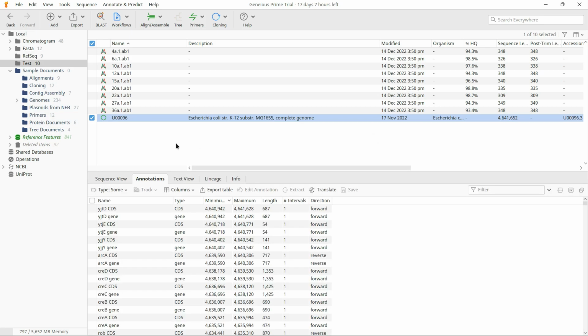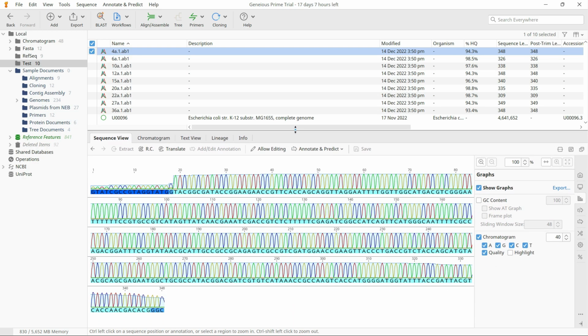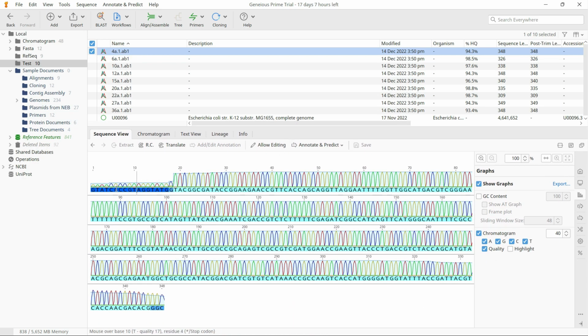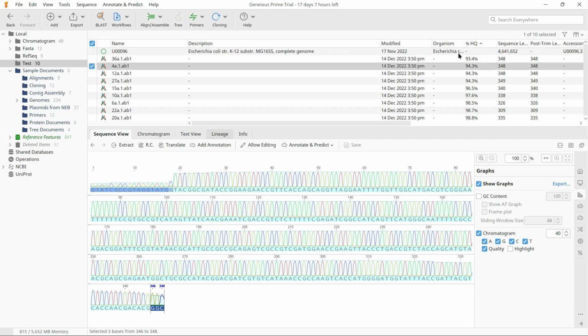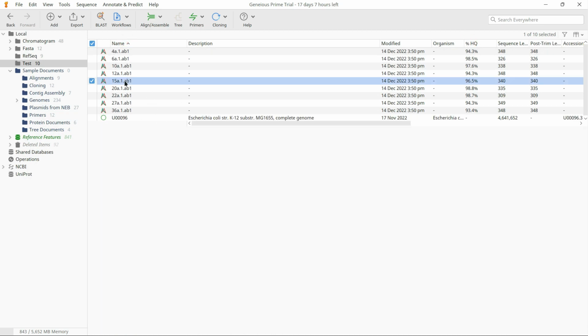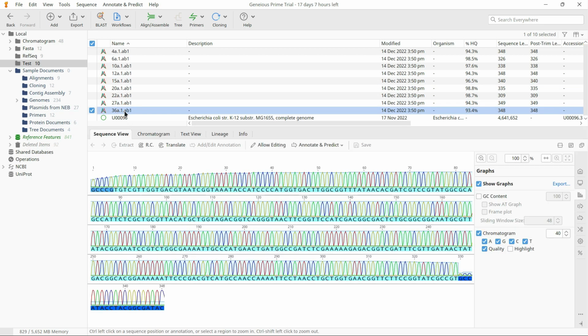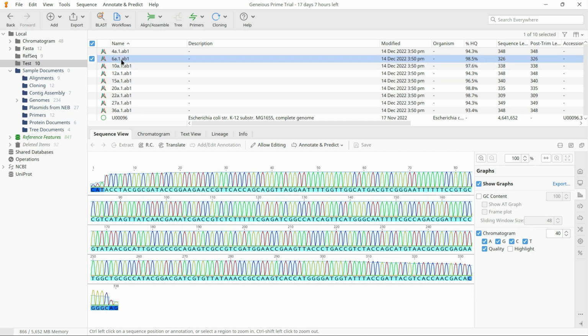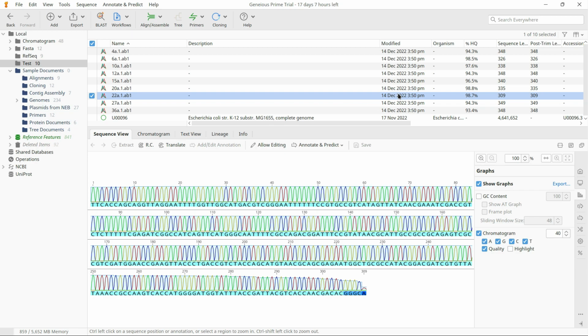The list of sequences appears immediately, where you can check parameters like the length and quality of individual sequences. The percentage Q or the sequence quality indicates how confidently the bases were determined. Hence, the higher the better. A closer inspection reveals that the ends of a sequence often have very dark blue highlighting, which refers to poor quality of the sequence of those particular bases. You can trim those regions before or during alignment, which is especially helpful for longer sequences, or you can simply ignore any anomalies or aberrations in that dark blue region.